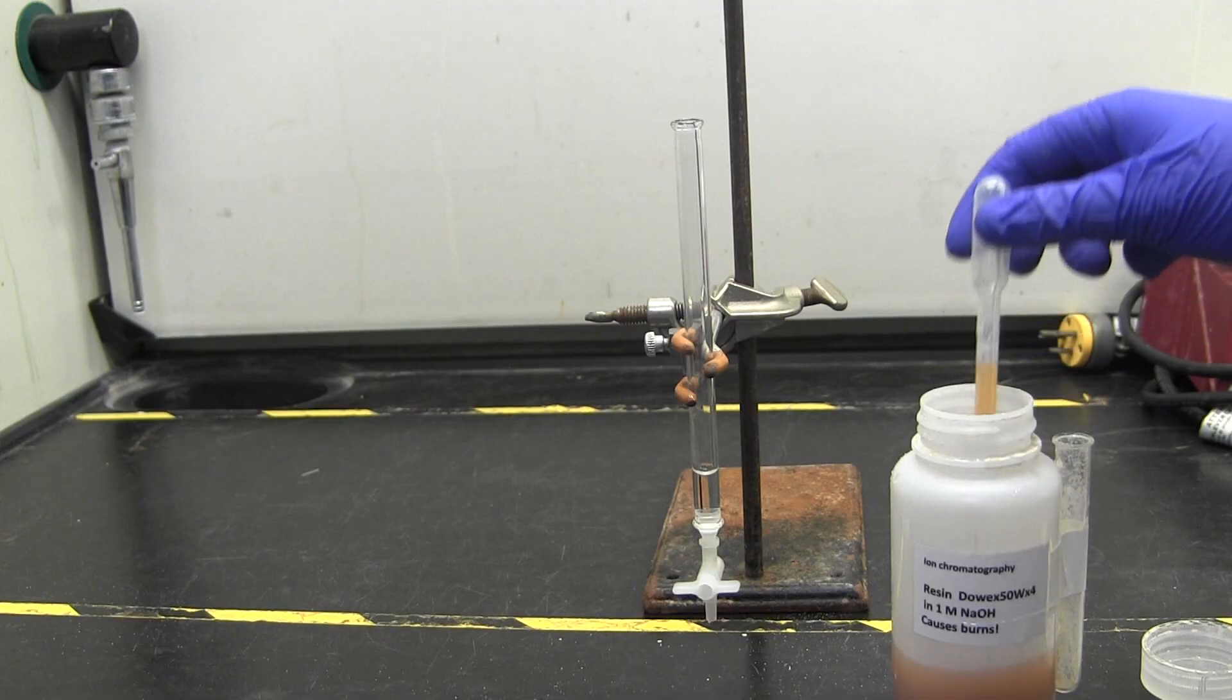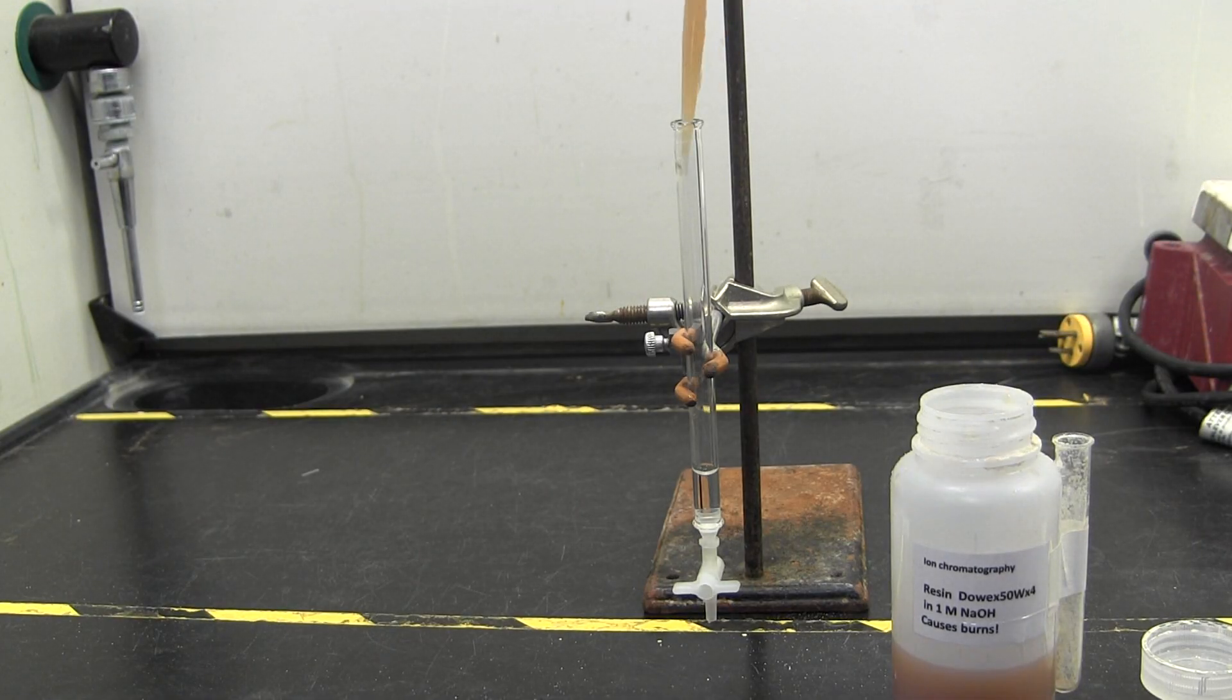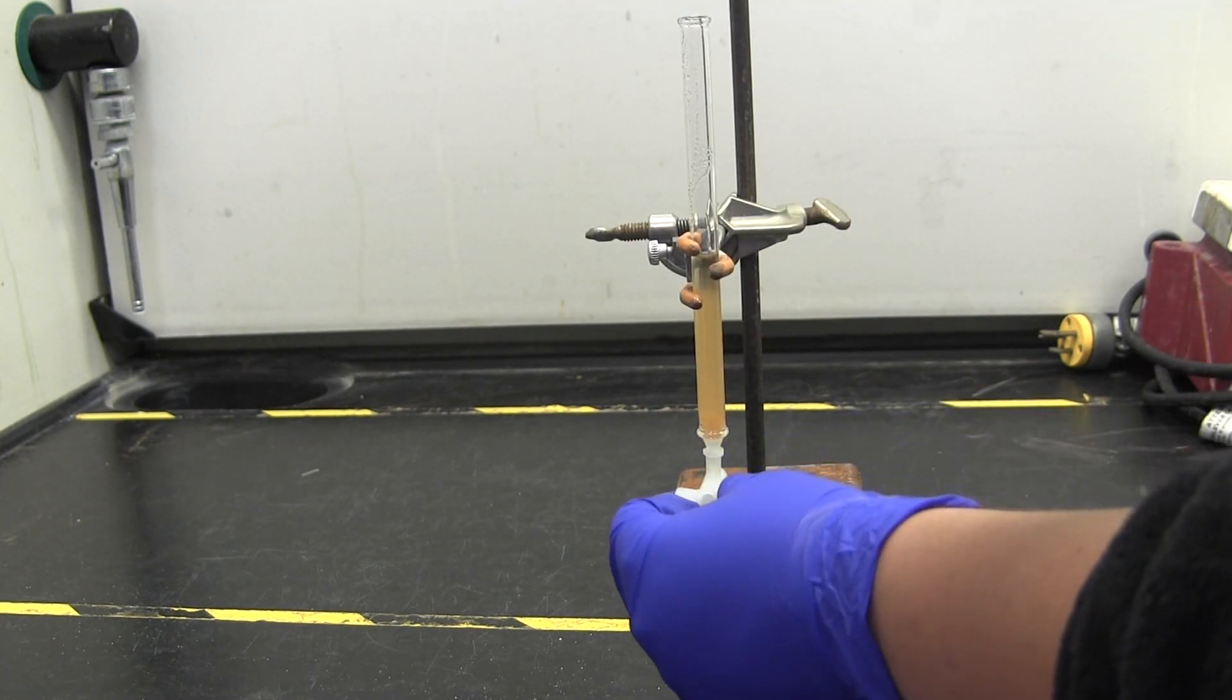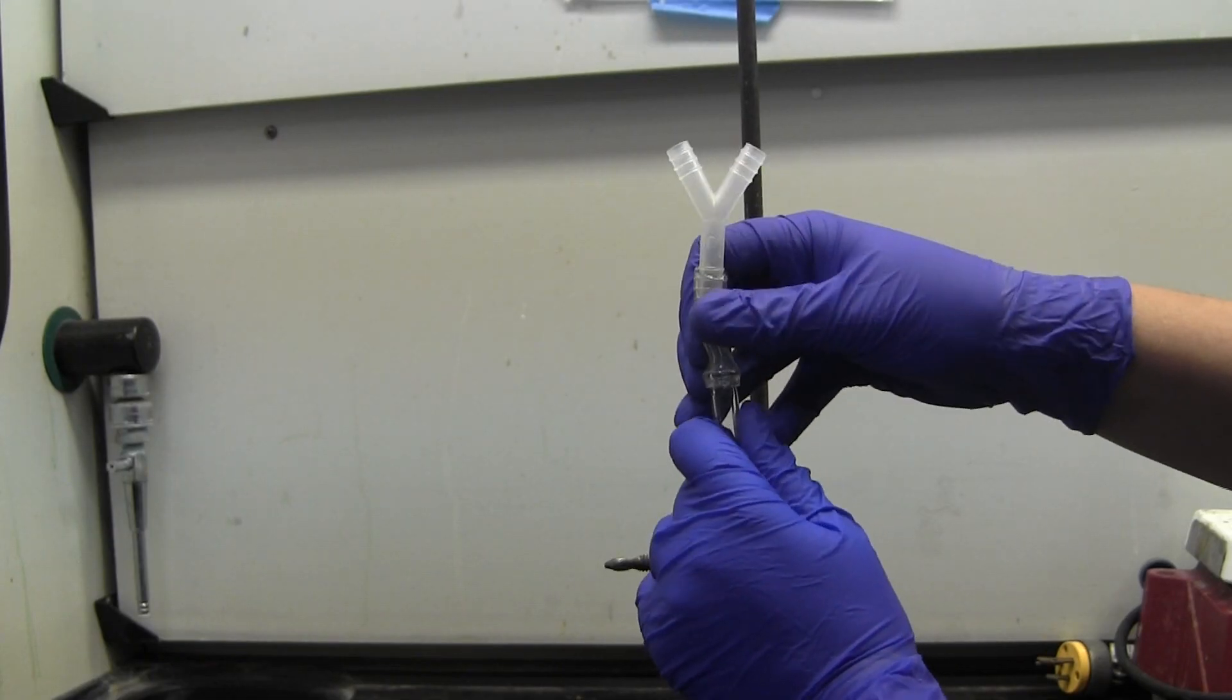Then, pipette some of the solution into the column. While making sure that the solution does not settle, continue loading your column until you have 2 to 3 centimeters of resin. Then allow the water to drain to settle the resin. This is also called packing the resin.